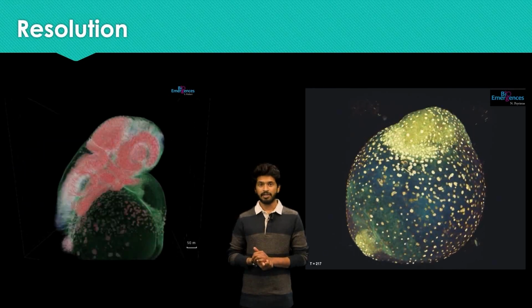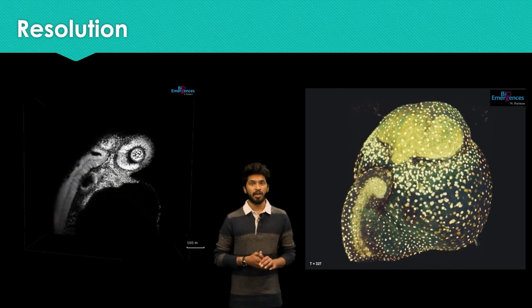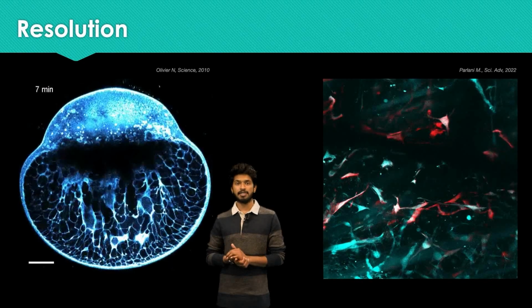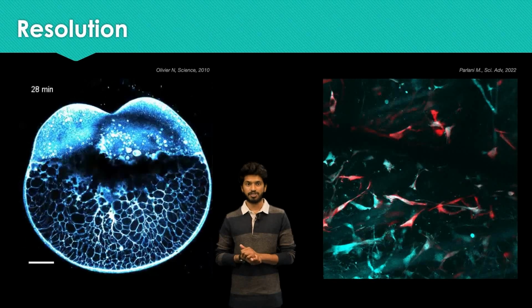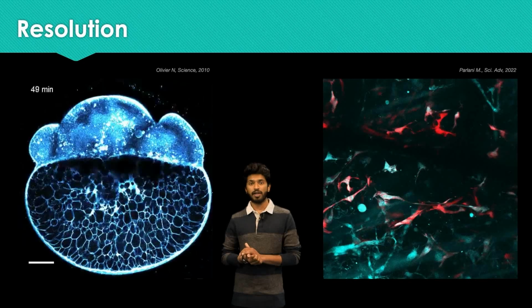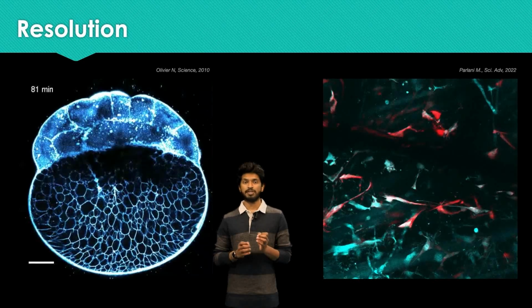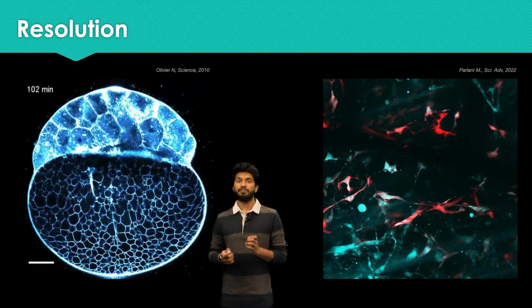With high-resolution imaging, we are able to observe the close interaction between cells and the proteins they produce. We can also observe cellular movements through tissues or organisms in live once the setup has been optimized for the sample being imaged. The optimization of the setup is crucial to high-resolution imaging. Different proteins and tissue components can be visualized using various sample processing methods, employing antibodies or dyes. This would give us a clear idea of protein and cellular functions and how cellular mechanisms actually work.